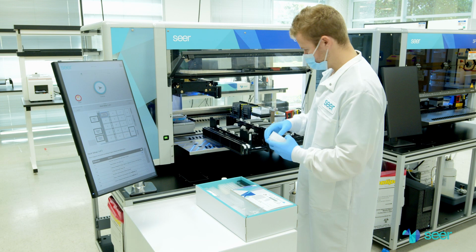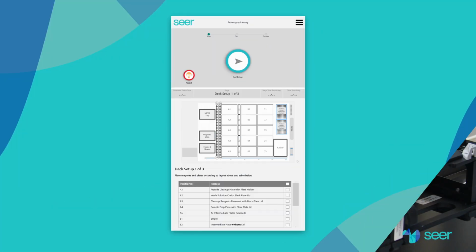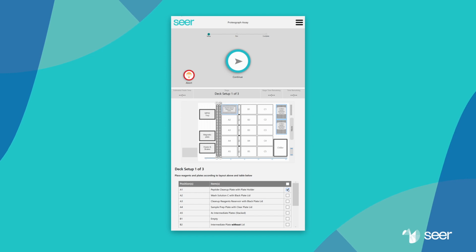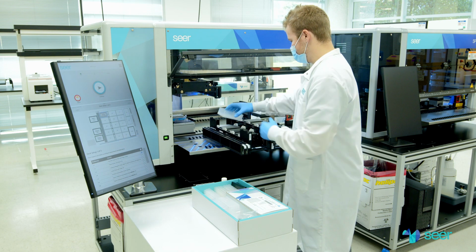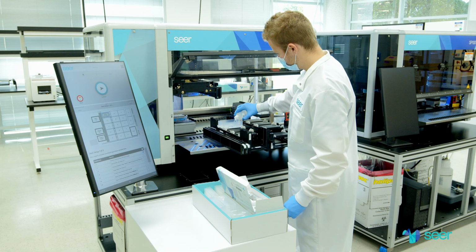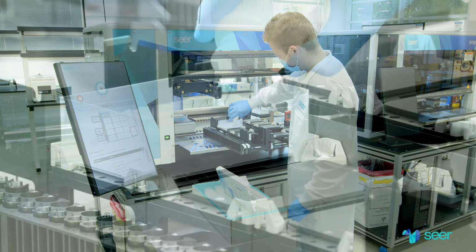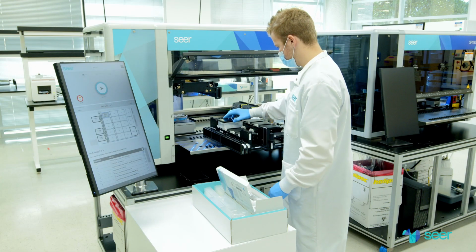The peptide cleanup plate with plate holder is loaded in position A1. The Wash C solution single reservoir is loaded in position A2. Pour 2 bottles of Wash Solution C into the reservoir and cover with a black plate lid.